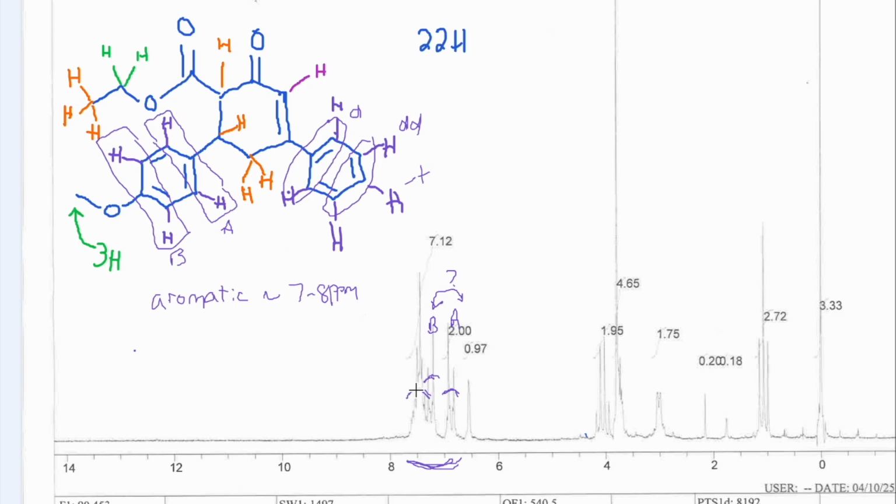So that's why for a mono-substituted benzene, we usually just see a lump of peaks that are very difficult to resolve into the doublets and triplets that they should be. So we have some more over here. Altogether, the 2 from B and the 5 from this entire benzene ring add up to 7. That's why we see a 7 integration here.